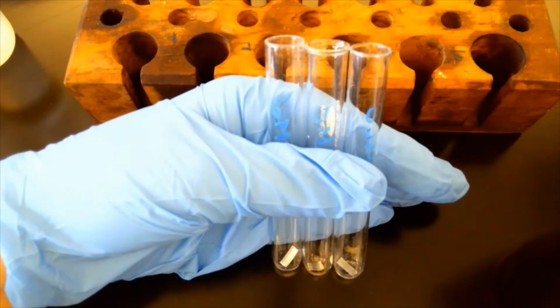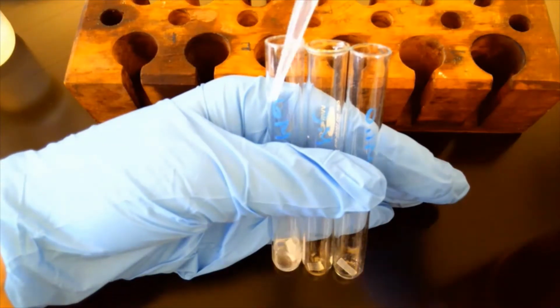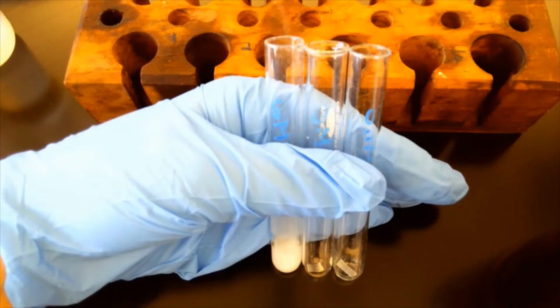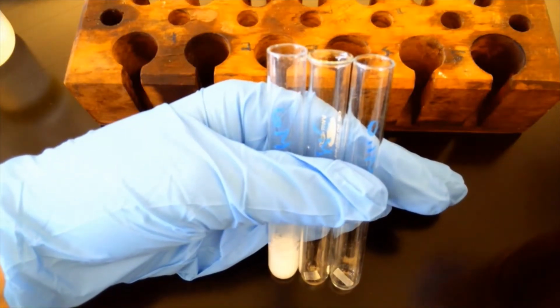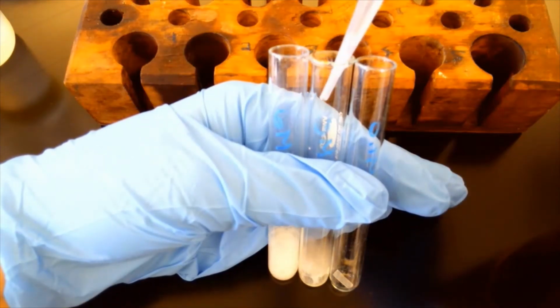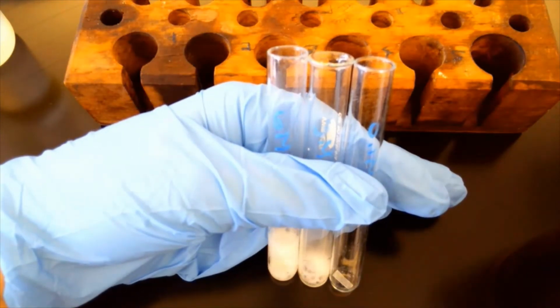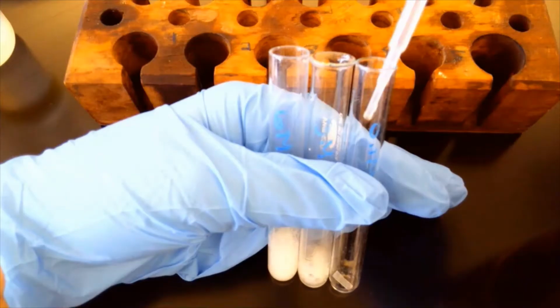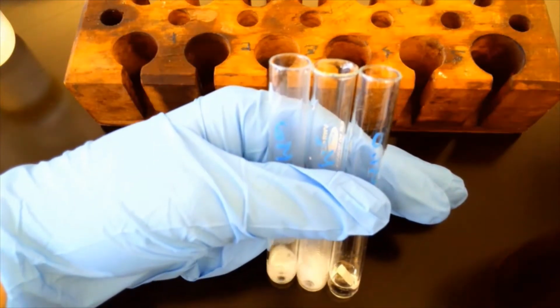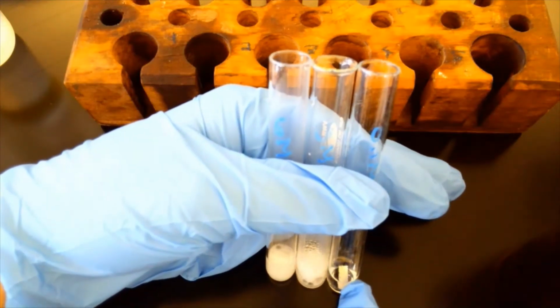We're going to add our 6 molar first. Again, you can hear it, you can see it. Hopefully it's getting very hot actually. Now we're going to do our 3 molar, not as vigorous as the 6 molar, and then we'll add our 0.1. Still definitely reacting more than the acetic acid did, but again very slowly.